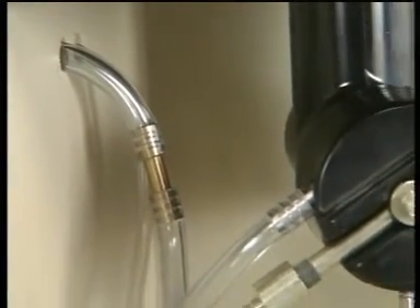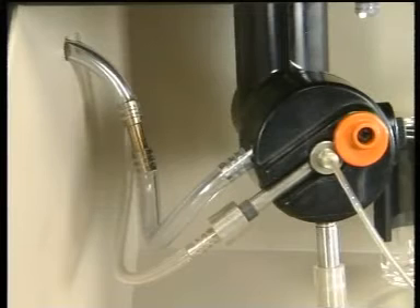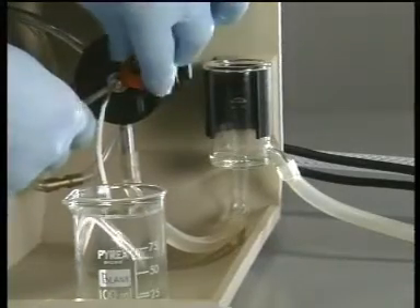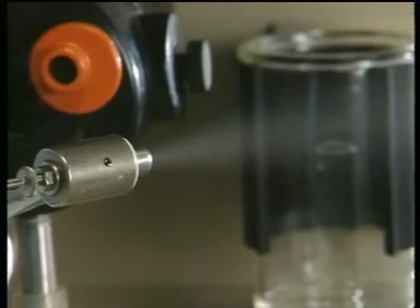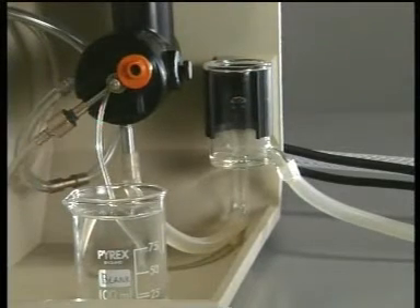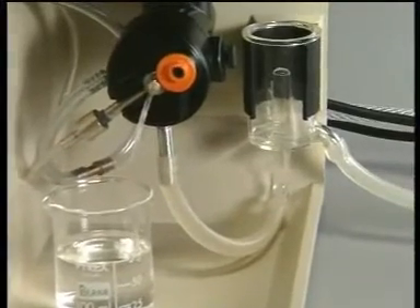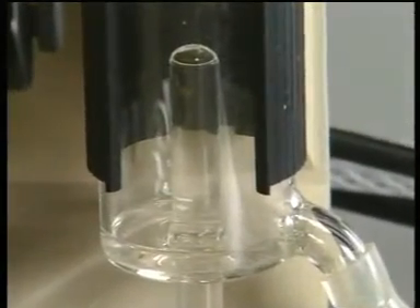The regulated air and gas supplies enter a nebulizer unit where they are mixed with the sample solution. The air flowing into the nozzle at the front of the unit draws solution up a thin tube and converts it into a mist. This then enters the nebulizer where it mixes with the gas. The nebulized mixture of gas, air and solution is fed to the burner. Excess liquid from the nebulizer passes into a standpipe which stops air and fuel escaping but allows excess liquid to run to waste.